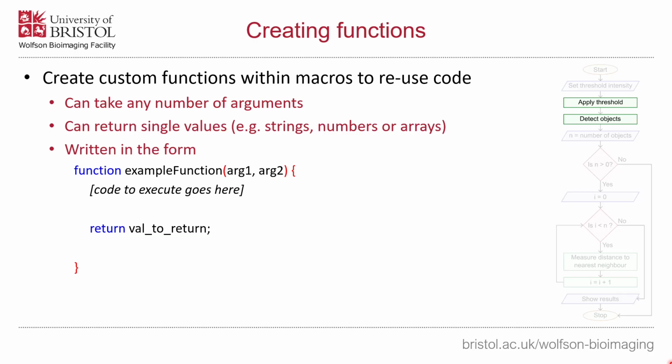You assign a variable, declare it at the top, and then you only need to change it once and it will propagate throughout the code wherever you've used that. All the same is true of functions. So we can create our own functions.